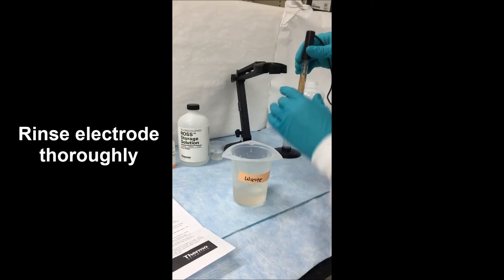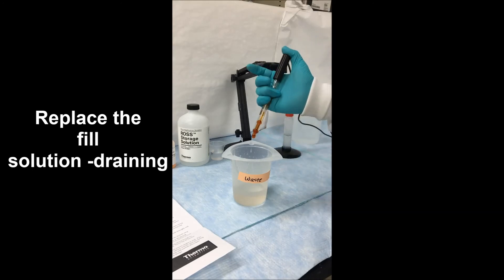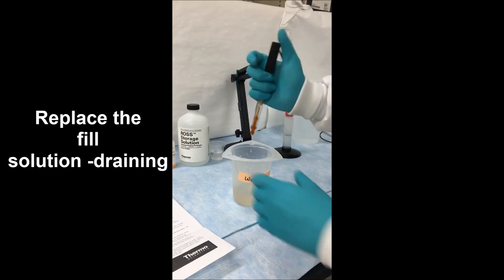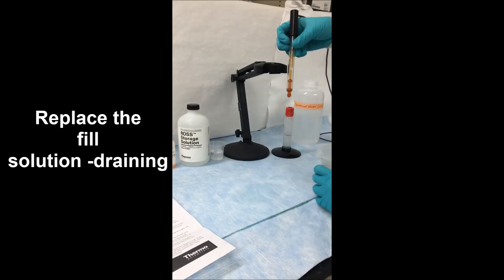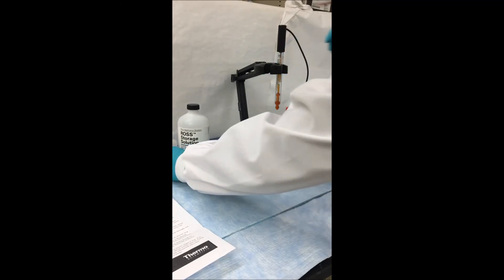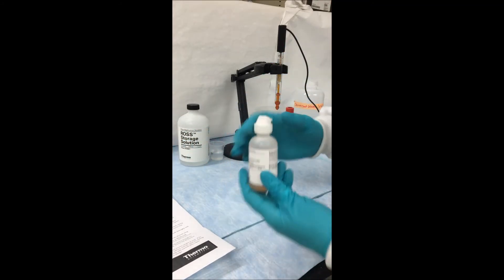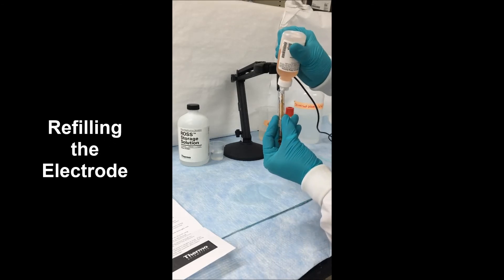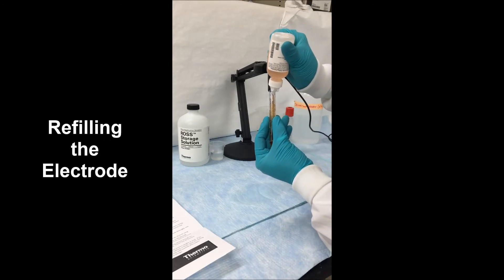Then, since this is a refillable electrode, we're going to change the fill solution, starting by draining the electrode and then refilling it. You always want to make sure that you clean your electrode full so that none of the cleaning solution can move inside of your electrode. Using the appropriate fill solution, fill that electrode all the way up to the top.